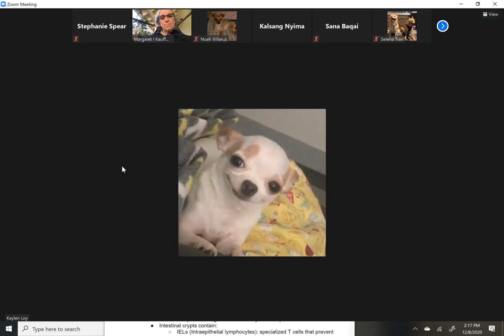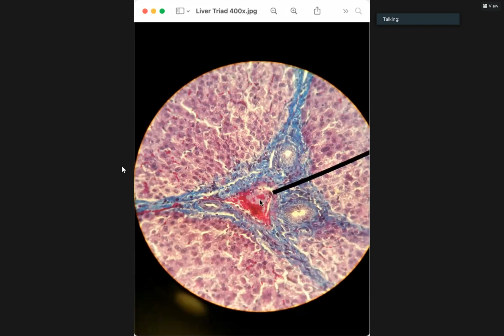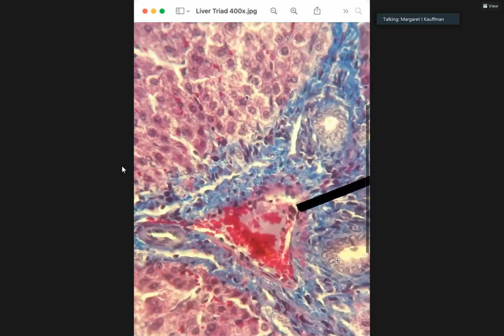Wait, sorry, can you go over the portal triad again? I didn't catch that one. The portal vein and the portal artery, the hepatic artery. Share. So the pointer is pointing at the portal vein. And then you can see these are, maybe I'll make them even bigger. You can see these are cuboidal cells, or even columnar they look, but they're cuboidal. Those are the bile ducts. And you see this has sort of a ring of lavender around it. That's smooth muscle. And the nuclei that line the interior are all kind of crowded together. This is an arteriole. So the venule is much larger and tends to be not circular. Arterioles are always circular. Ducts are more or less circular. And this has blood in it, so that's why you don't see it look hollow.